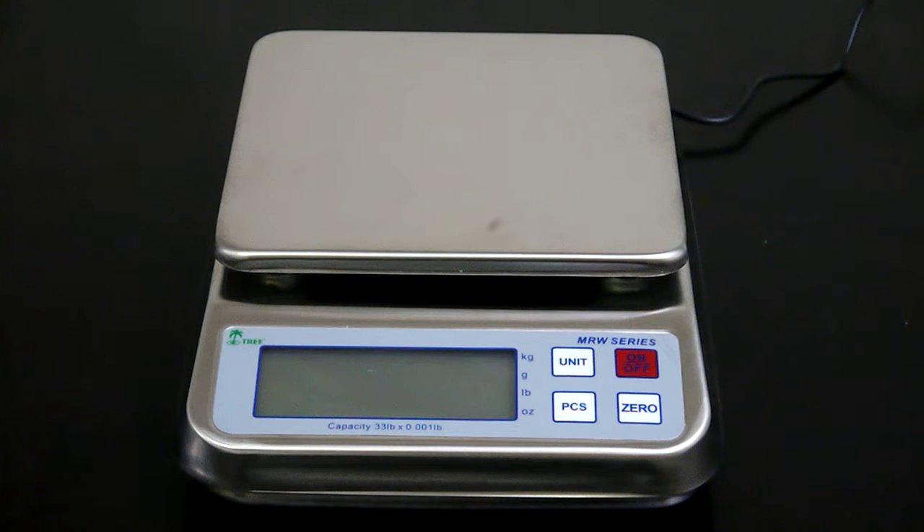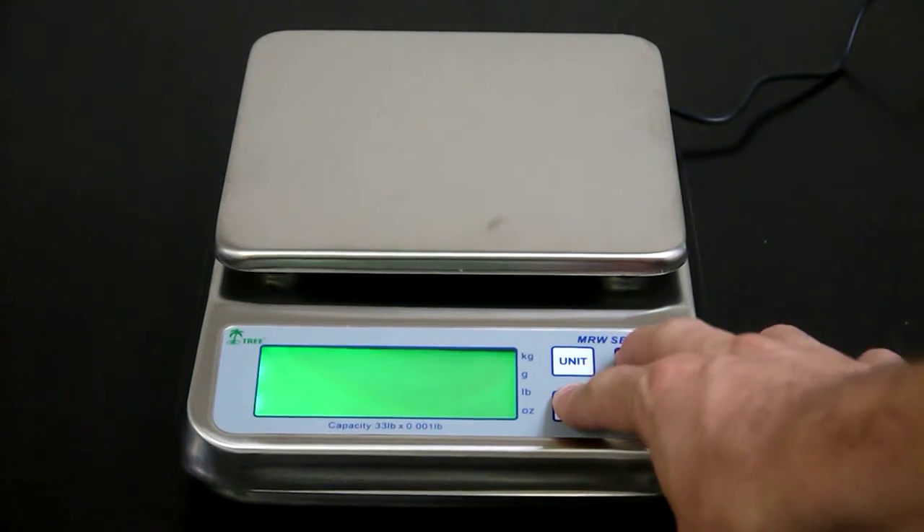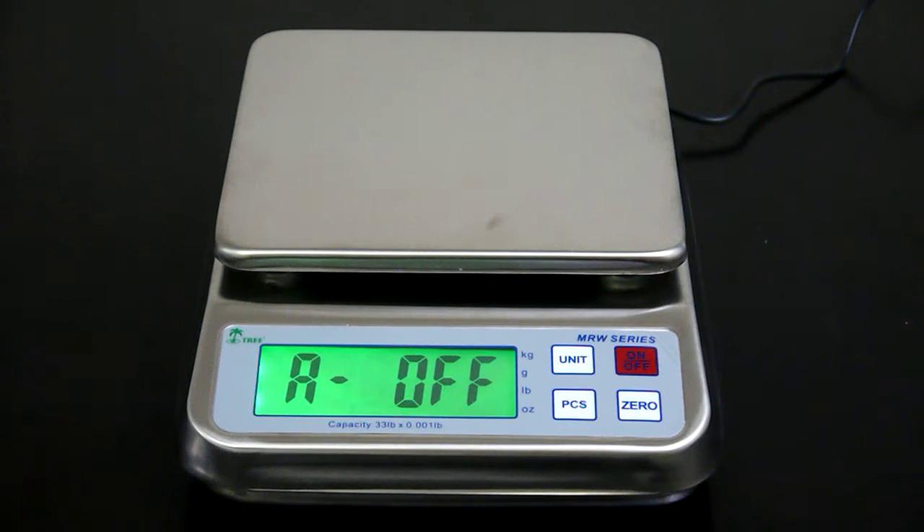To begin, you want to open up the function settings menu. To do that, press and hold the PCS key, then press the on key. Your display will then say either A off or A on. Using the zero key, you can turn auto shutoff off or on.